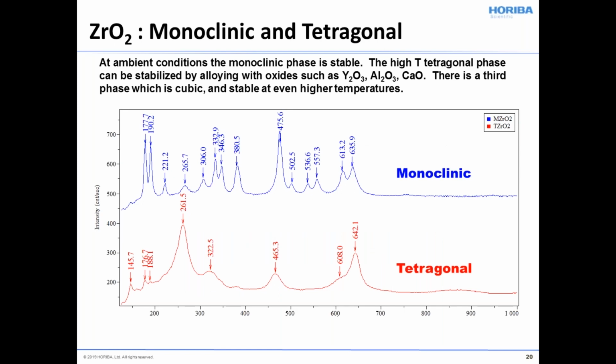So here you have, I always found this fascinating, quite frankly. I'm sort of a guy who likes group theory and crystallography and so forth. So I think this is actually fairly remarkable, that you can use Raman spectroscopy in a fashion that's complementary to X-ray diffraction. Now, don't get me wrong. If you can do X-ray diffraction, by all means do it.